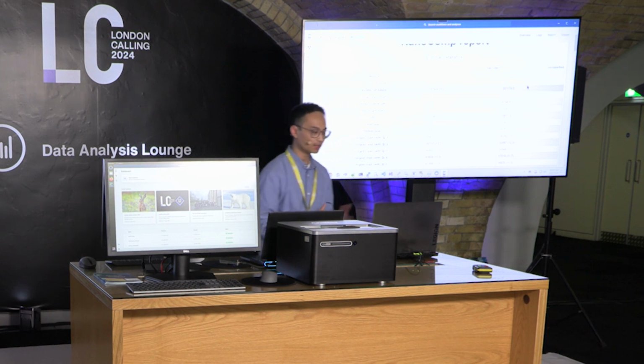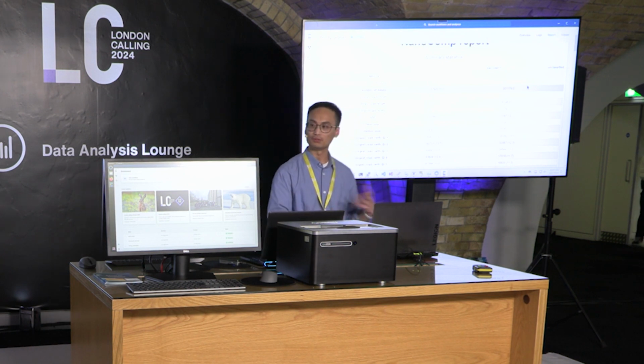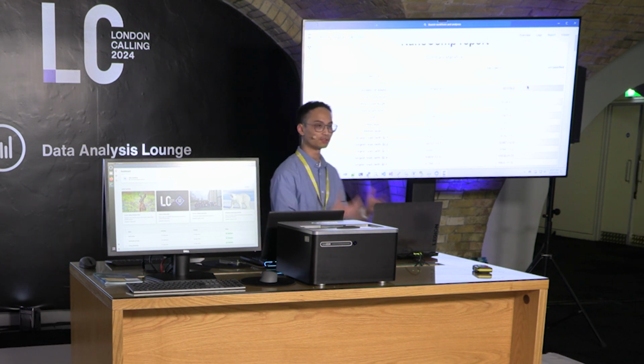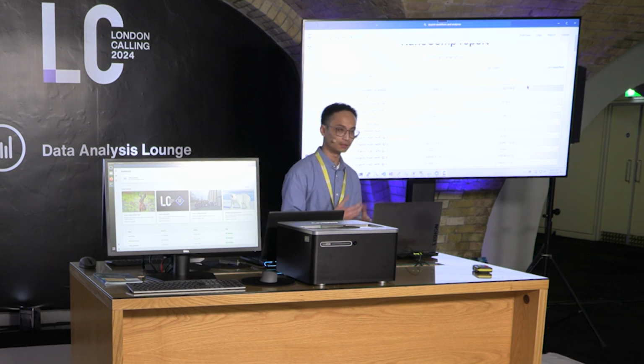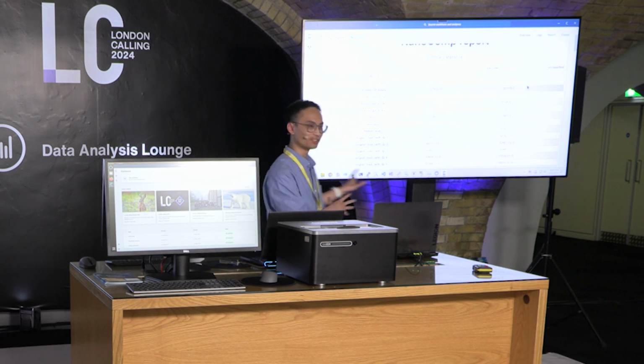And so the idea is that as we're generating these base calls, as we're generating new information, the pipeline is iteratively updating these reports as new information becomes available, and to ensure that these reports are reflecting the most up-to-date information. Now, this is just looking at raw sequencing data quality.